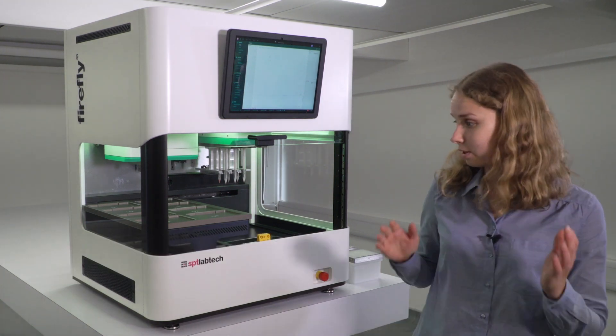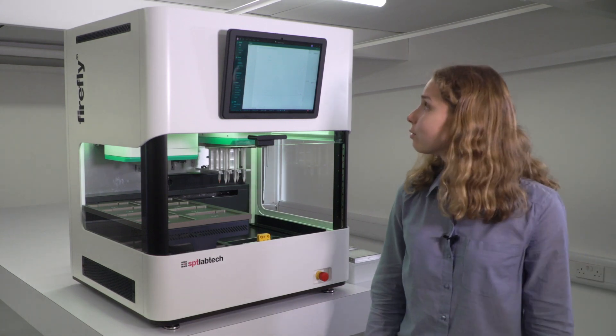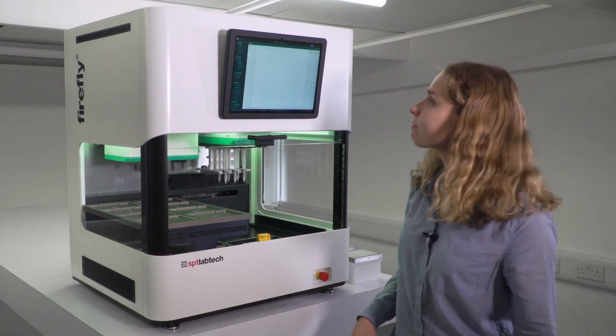Hello, I'm Maria, a product development scientist at SPT Lab Tech, and I'm here with my favorite instrument, Firefly. I'm getting ready to run a pooling protocol, and I'll walk you through how exactly I'm going to do that.